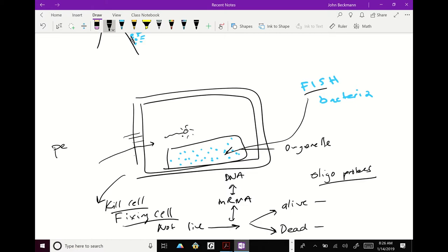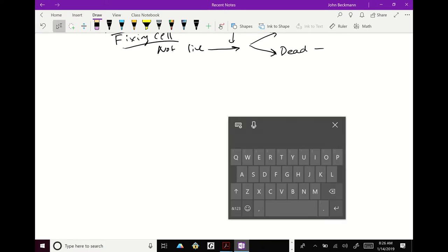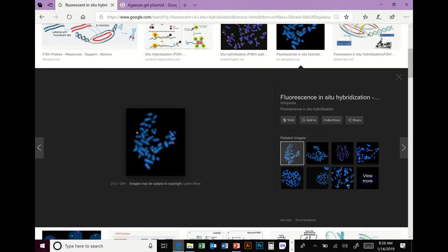Positive and negative control for FISH. Let's look at that experiment. Maybe in one scenario, this person picked a gene on the X chromosome, and their positive control was maybe the red sequence probe, and their test probe was the green one. So this is their X, their random variable that they're checking, and then this is their positive control. And maybe what they're actually looking for is a recombination event where those two sequences came together. Maybe that's what they're actually measuring here.